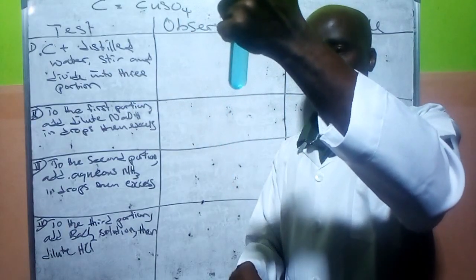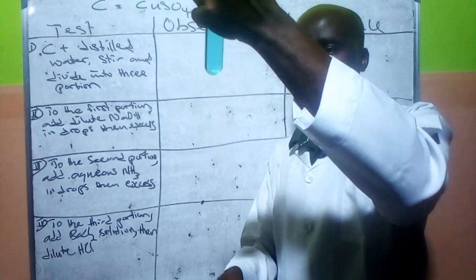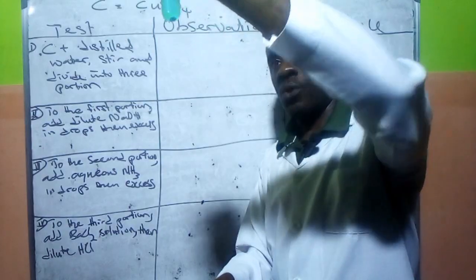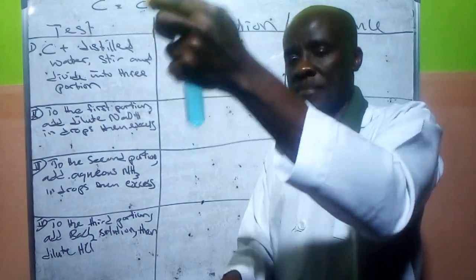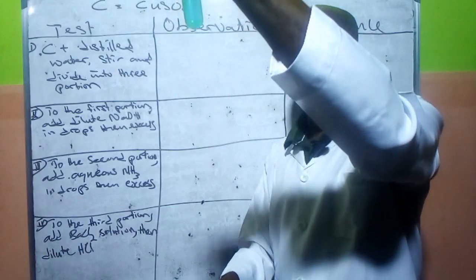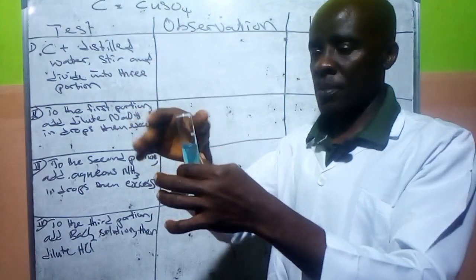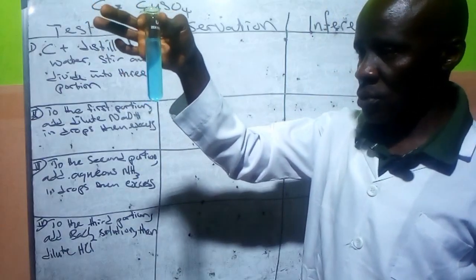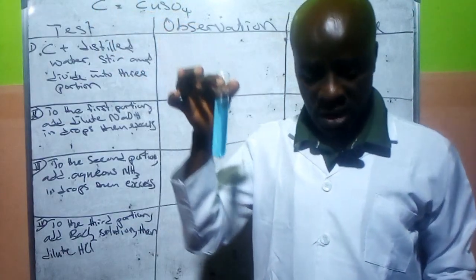Let's see what we have here. Yes, it's soluble in water, giving us a light blue solution. That is what we have in our observation.